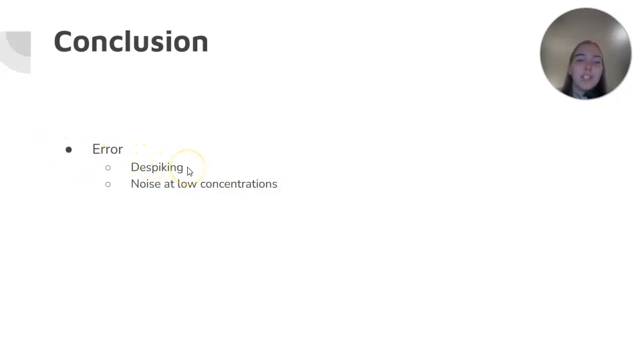I did say I'd talk about despiking later. One of Dr. Zhao's students did say that the website had been having issues with despiking, so there is a possibility that on our 3 lowest concentrations where we used that tool, we could have introduced more error into the results of this experiment. So that is something to take into consideration.